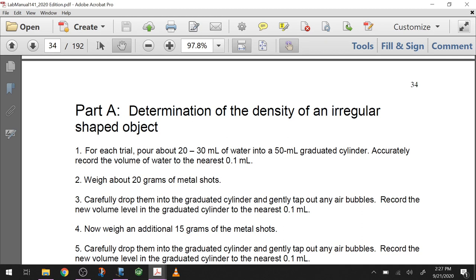We kind of have to have an idea of volume. The smaller the graduated cylinder we use, the better in terms of accuracy for the volume. But these are relatively large pieces, so using a 10 mL graduated cylinder really isn't going to work. We're going to end up using either a 25 or specifically a 50 mL graduated cylinder—not because we need a large volume, but because we need a large diameter to make the metal pieces actually go in there comfortably.